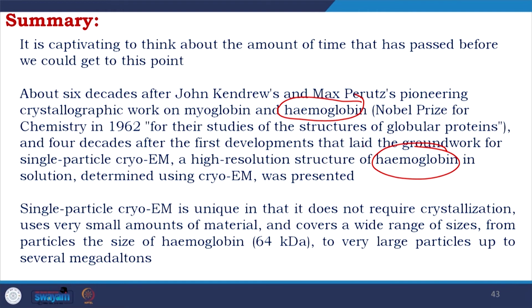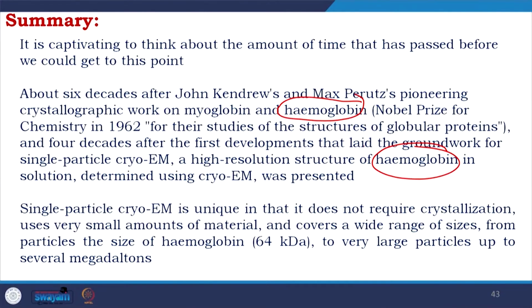Single particle cryo-EM is unique in that it does not require crystallization. As I told you, for a long time this has been a criterion. It uses a very small amount of material and covers a wide range of sizes, from particles the size of hemoglobin, 64 kilodalton, to very large particles up to megadaltons.